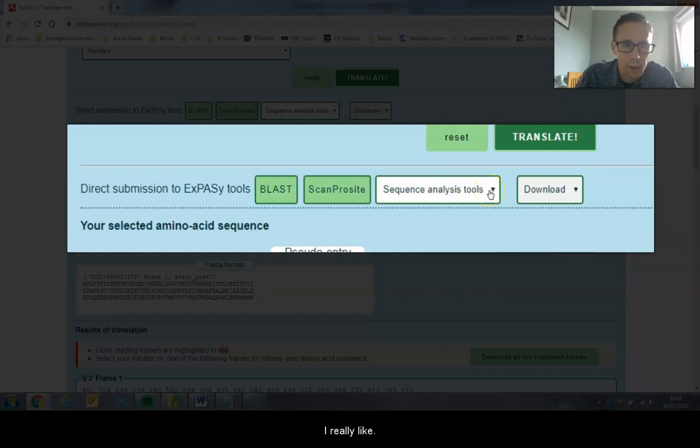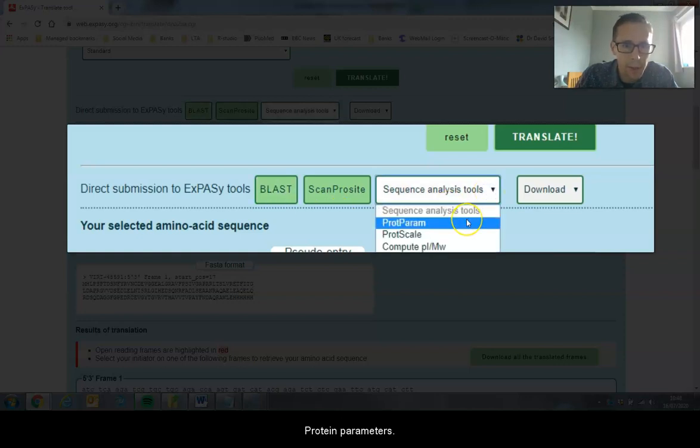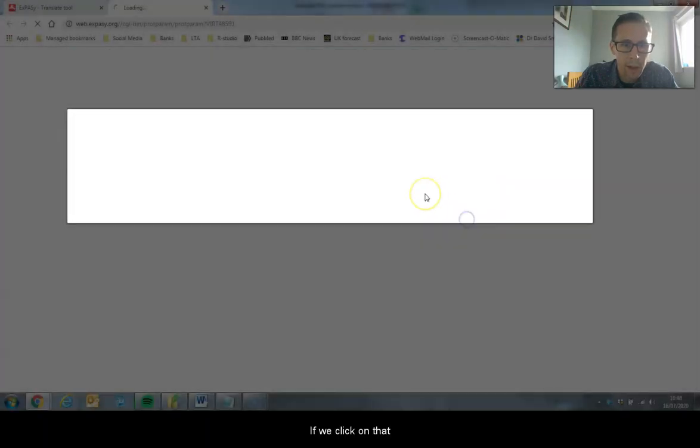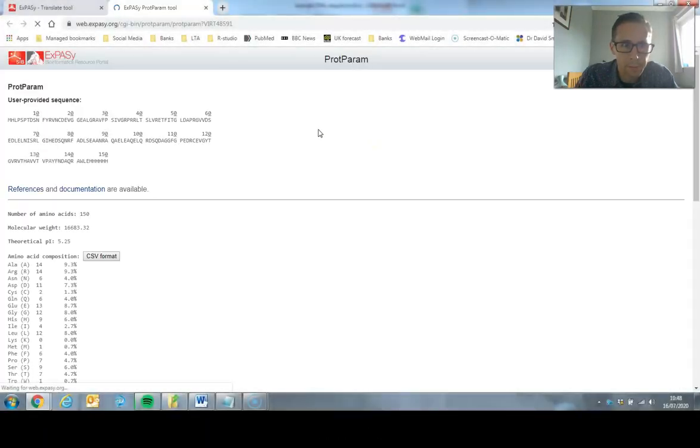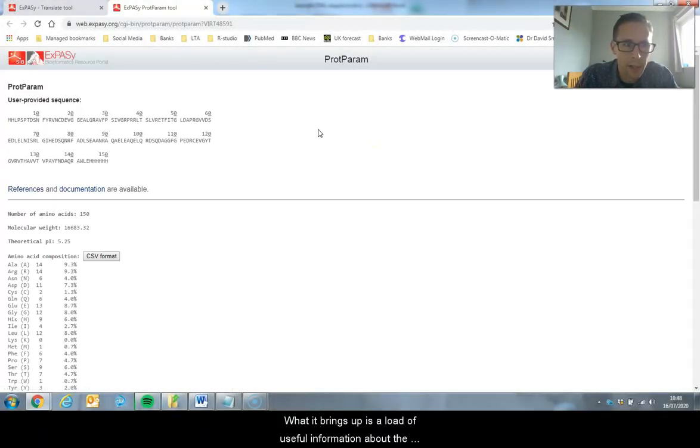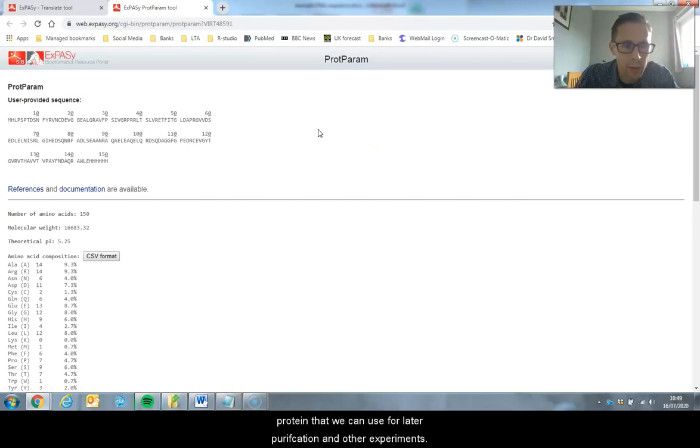The other tool that I really like is protein parameters. If we click on that, it brings up a load of useful information about the protein that we can use for later purification and other experiments.